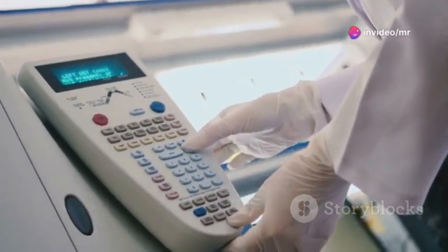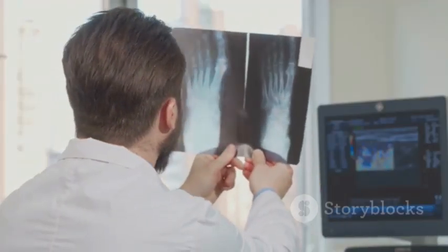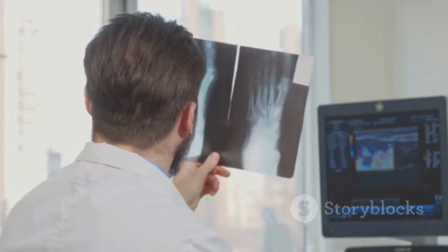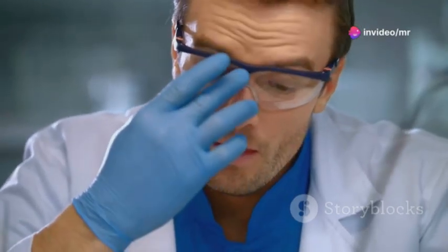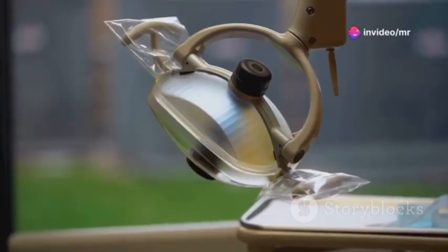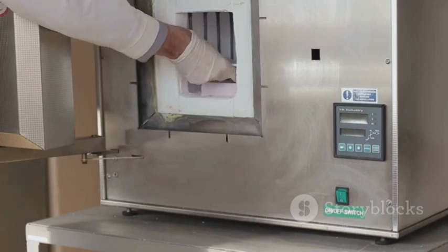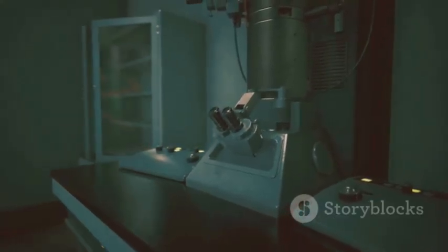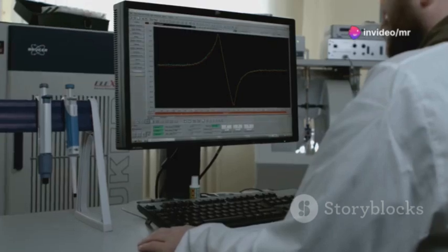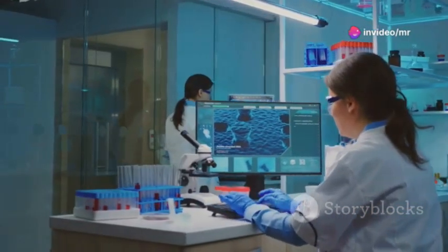Now let's meet the star of the show, the XRD machine. Don't worry, it doesn't bite. An XRD machine is like a sophisticated camera that takes pictures of materials using X-rays instead of visible light. The basic components of an XRD machine include: X-ray source. This part generates the X-rays. Sample holder. This is where we place our material sample. Detector. This component measures the intensity of the scattered X-rays. Computer. This is the brain of the operation, controlling the experiment and analyzing the data.